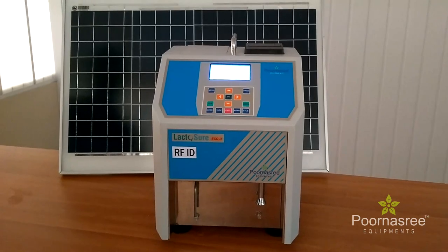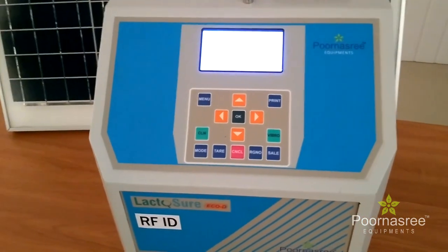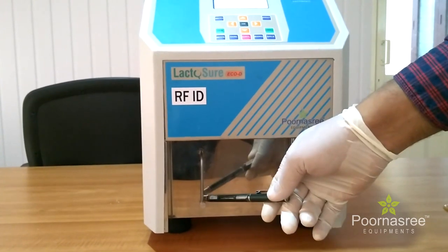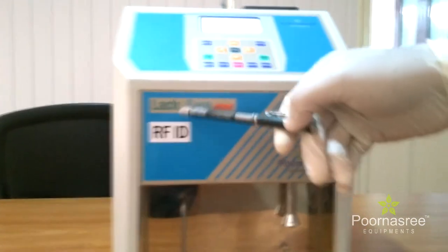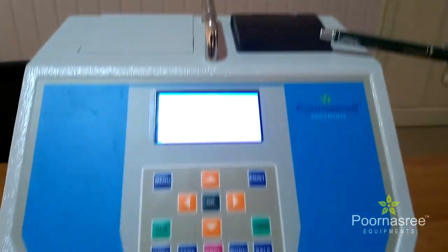Now the major controls and additional features of this equipment. One part of the Lactosure Eco DS is the vibrator part. This is the analyzer part. This is the RFID part. This is the key part. This is the display. And this one is the printer.